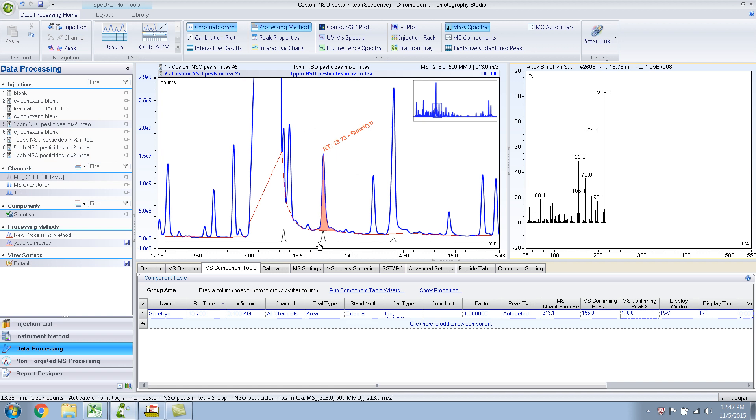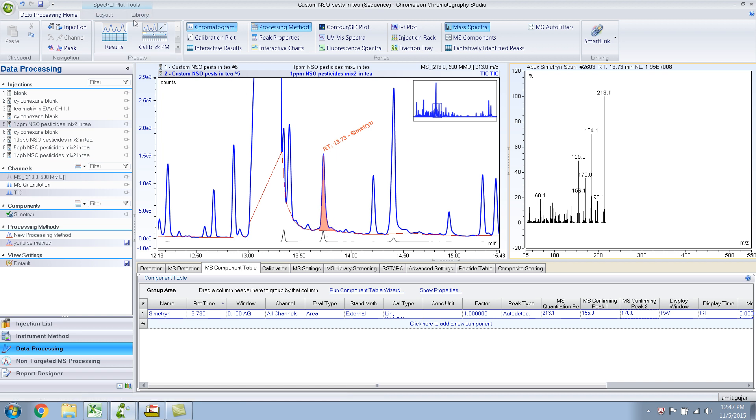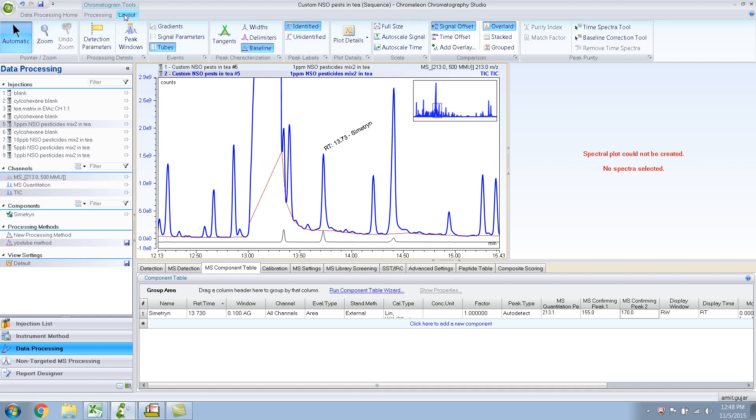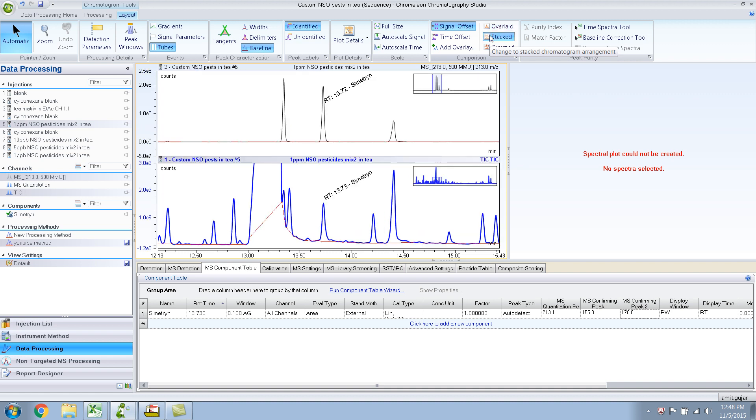So it has extracted. The view is overlaid, so let me change it. I want it in a separate window. What I would do is go to the chromatogram pane layout and do stacked.